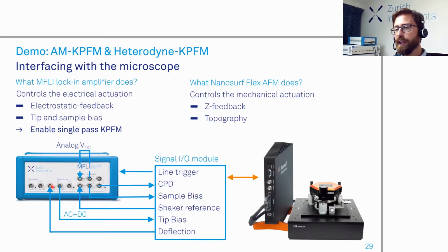And for the electrostatic actuation, you need to have some tip-sample bias voltage. So one or the other on ground, or if you want to apply some additional offset, you need to do it for both this probing voltage AC and this compensation voltage DC. Now, for FM mode, you also need to have the mechanical phase.